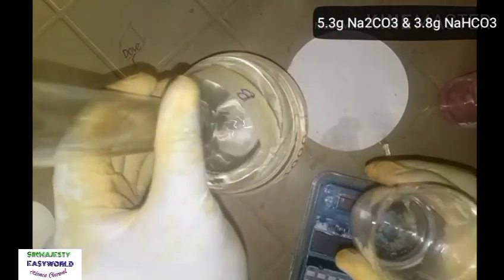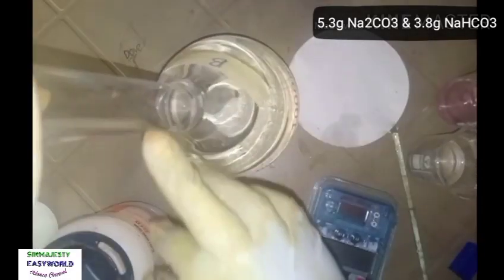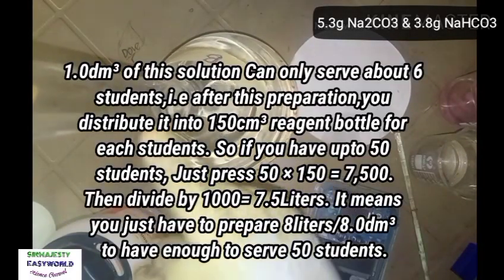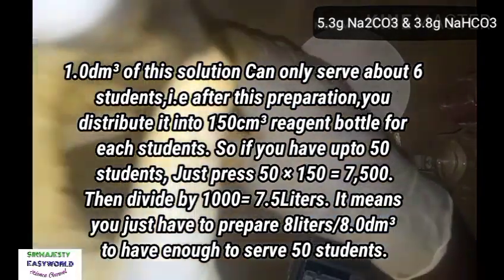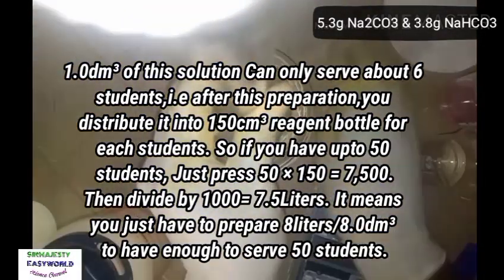After shaking well, you now go and bring distilled water again. When you get the distilled water, you add it to this volumetric flask. You now add it up to 1000. Yes, you fill the remaining volume until it gets to that mark and shake it well. You are done with your preparation of B, and that's how to prepare B.